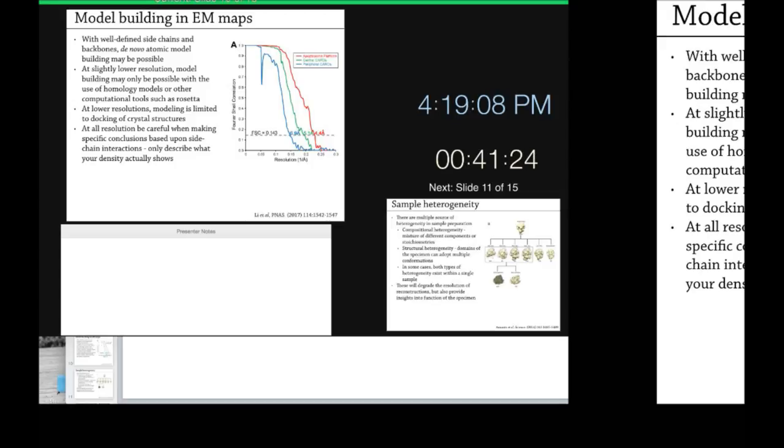A question about the comment you made about the ligand. So you're saying that in some cases, even at low resolution, you can see the ligand, and in other cases, you don't see the ligand until high resolution? Other cases, even at high resolution, you won't necessarily see it. Ligand occupancy is, because we don't have a crystal, we're not forcing everything to obey one conformation. You often have a mix of samples. You'll have some that have ligand and some that don't. And ligands are often such a small fraction of your overall mass that it can be really hard to sort ligand bound versus ligand free out if there's not a larger conformational change accompanied by it. I see. That's why you end up seeing those observations, because you've actually incorporated particles without the ligand. Yeah, and it can be really hard to sort those out. Other times, if your ligand generates a 45-degree rotation or another large conformational change, then it's quite easy, because your global particle classifications should sort out the ones that are ligand-bound from the ones that are ligand-free.